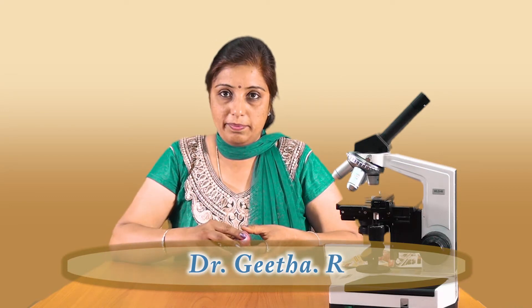Hello viewers, today we are going to learn how to mount an onion peel.